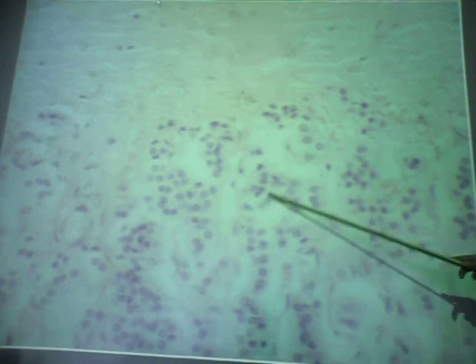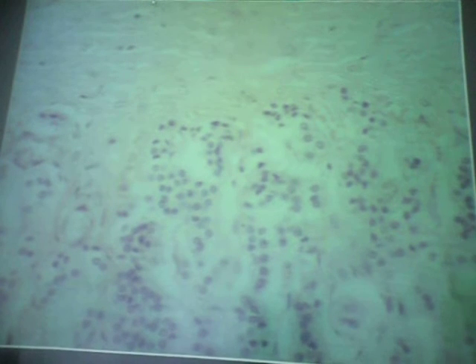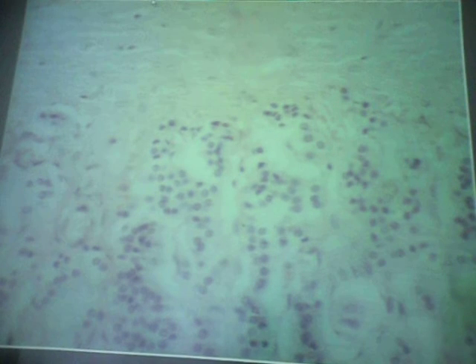So these things right in here, okay? These are cells of the zone called the zona glomerulosa for that reason. So they sort of look like the glomerulus of the kidney, at least to some people. Have a good imagination. Now these cells produce a class of hormones which regulate ion levels in fluids. These are called mineralocorticoids because your ions are minerals, okay? The major one in humans is a hormone we've talked a lot about already, aldosterone.